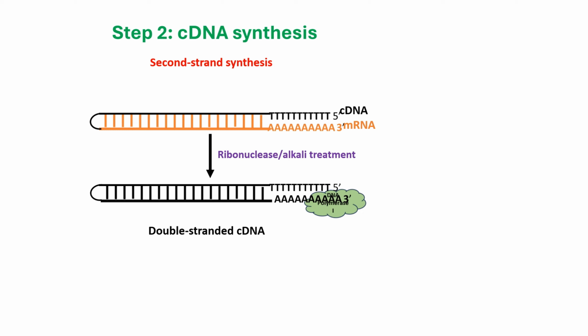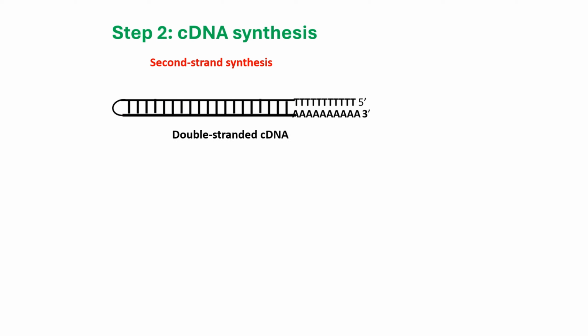But the problem is that this double-stranded cDNA that we have has a hairpin loop at the end, and we don't like the hairpin loop.